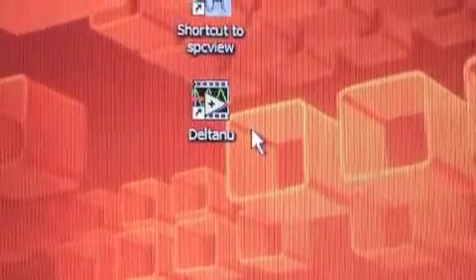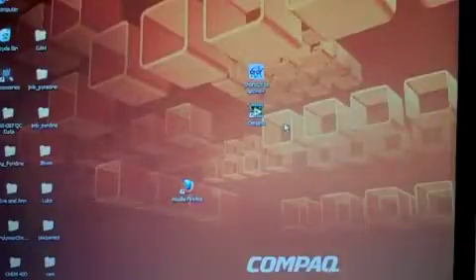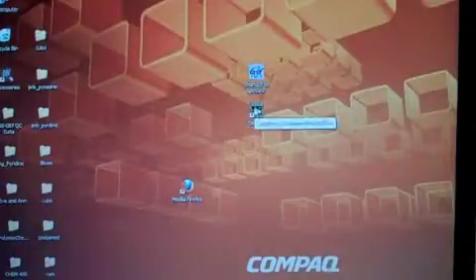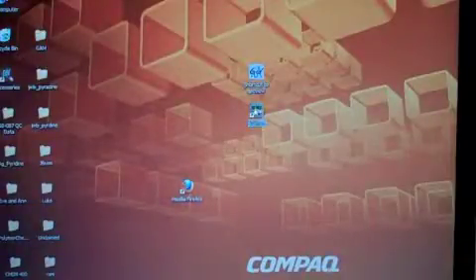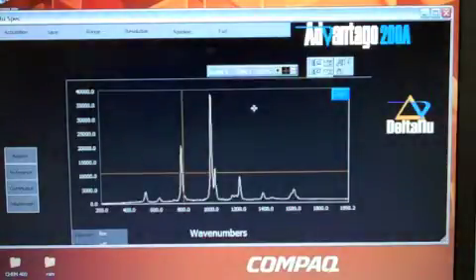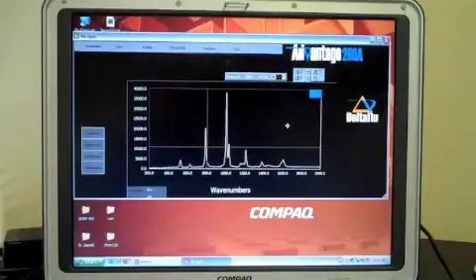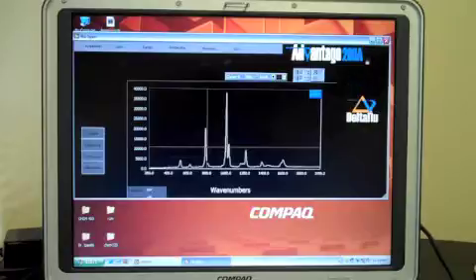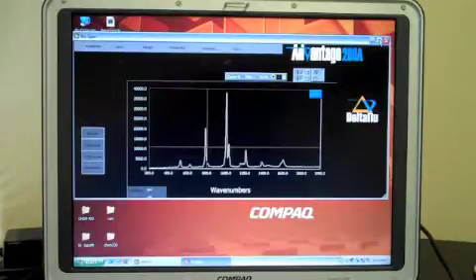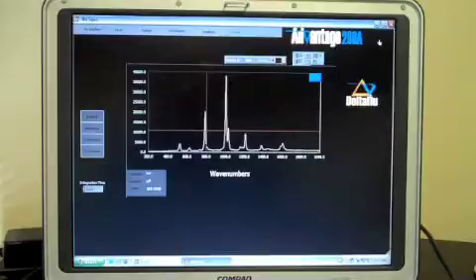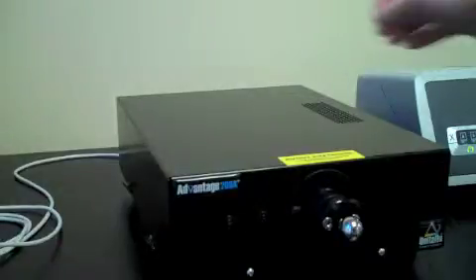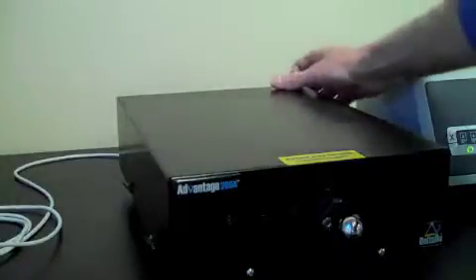After booting up the computer, launch the operating software by double-clicking on the yellow, black, and green Delta Nu icon located on the computer desktop. Maximize the window for the application by clicking on the square icon in the upper right-hand corner of the screen. Turn on the spectrometer with the power switch located in the upper corner on the back side of the black box.